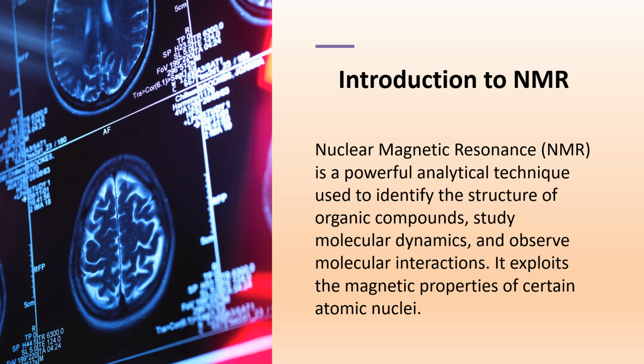Beyond structure, NMR is crucial for understanding molecular dynamics, how molecules move, interact, and respond to changes in their environment. This makes it indispensable for studying molecular behavior, from drug interactions to protein folding. Essentially, NMR transforms invisible atomic interactions into clear, interpretable data, allowing scientists to decode the complexity of molecules with precision.